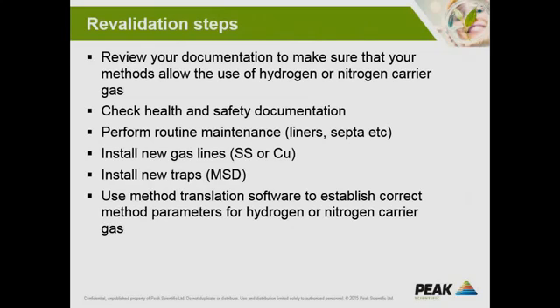Then it's necessary to perform routine maintenance, for example, replacement of liners or septa. Also, if you're looking at GCMS using hydrogen, you want to make sure that you have the pumping efficiency required for the use of hydrogen. I would recommend installing new gas lines, stainless steel preferably, especially if you're using hydrogen, but copper will also do as long as it's analytical grade.